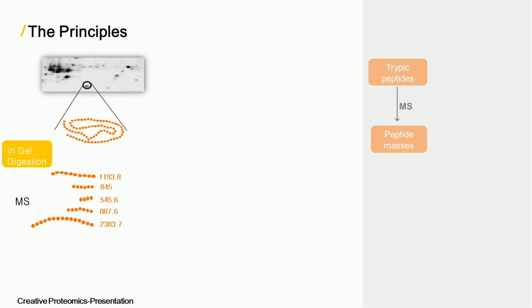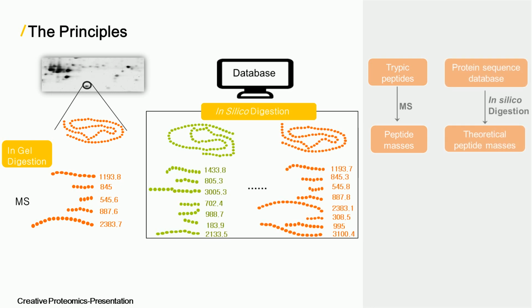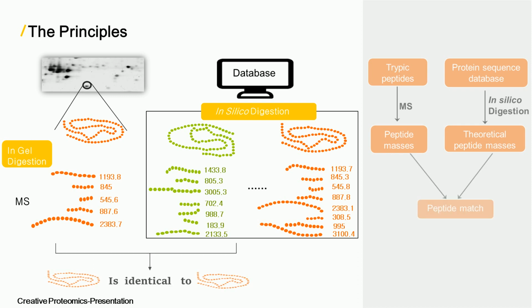In this technique, after separation of proteins by gel electrophoresis or liquid chromatography, and being cleaved with proteolytic enzyme, we can get experimental peptide mass through mass spectrometry. And the theoretical masses are achieved by using computer programs that translate the known genome of the organism into proteins, or the proteins in the database, then theoretically cut proteins into peptides, and calculate the absolute masses of the peptides. The experimentally obtained peptide masses are compared with theoretical peptides masses. The results are statistically analyzed to find the best match.